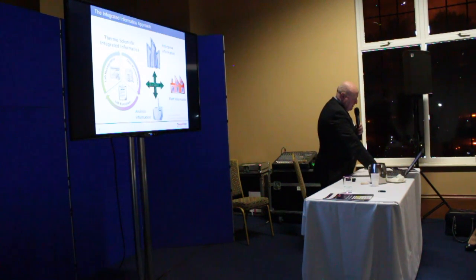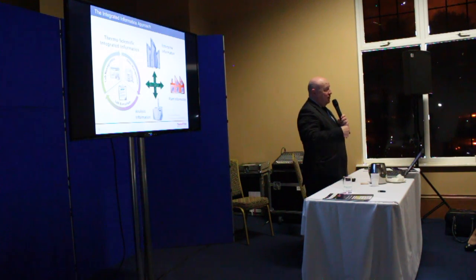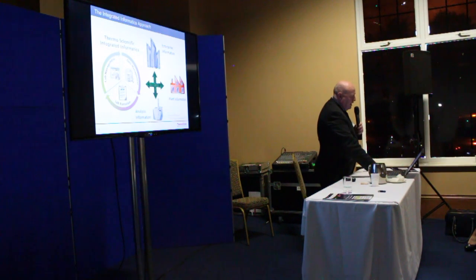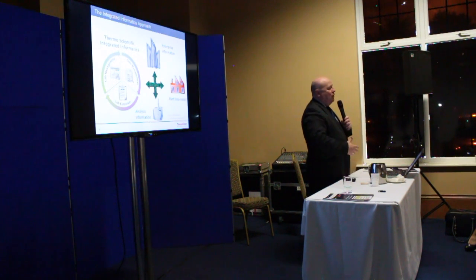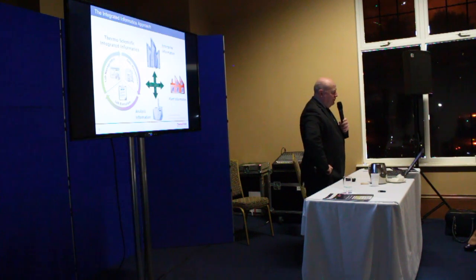On the left pane there, these are the key areas an information system in the laboratory provides. So basically, recording your test results, whether it's manually entered or captured from an instrument. Also, recording raw data. Historically, companies are now able to archive all the raw instrument data. A big area for that will be pesticide testing, for example, having vast amounts of data that comes off the GC-MS archived and being able to look over the history of that data for a number of years to detect trends in the data or identify particular features that you need to look for in your testing.